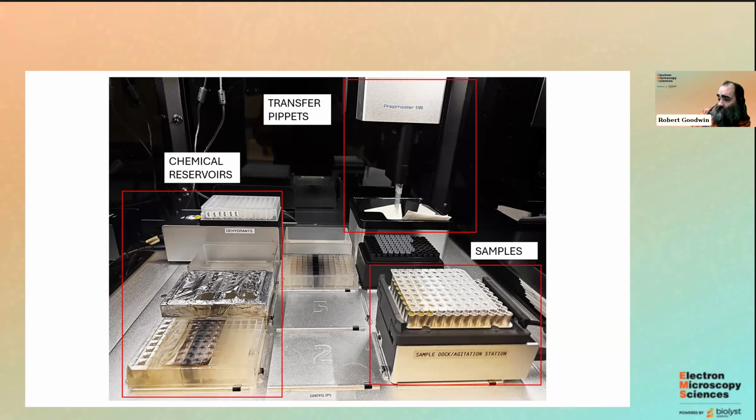But I have set this up to do cover slips. I can do Eppendorf tubes. I can do BEEM capsules and 5 mL tubes as well, and it's just a matter of moving things around a little bit to accommodate it and selecting the proper protocol that you've written for it.